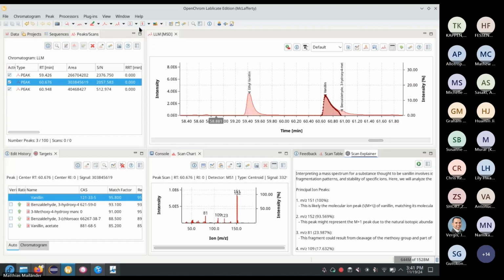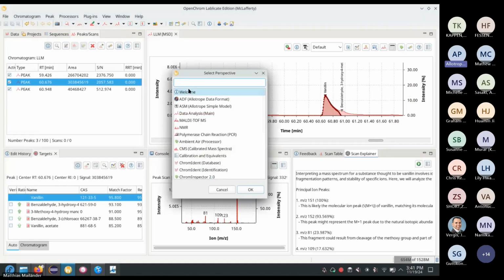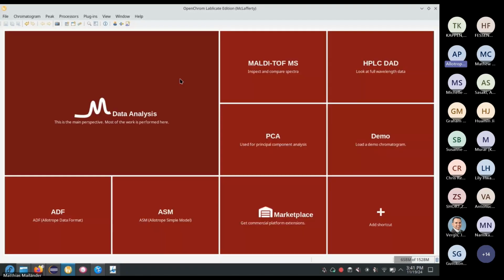So my closing remark basically is, let's go back to the welcome screen. If you say, yeah, it's a nice fat client that you showed there. We migrated everything to web like 3 years ago. We have web developers in our company who can do this much better than me, and they already made some prototypes for ADF and ASM viewers, which also use ASM natively as a data source. It's really cool.